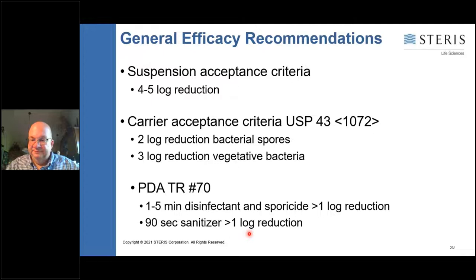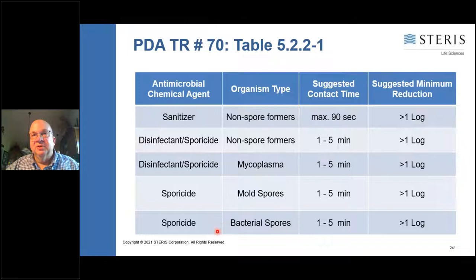This is a very nice table from PDA's Tech Report 70 that spells out what the different organisms are, what the antimicrobial agent is, so sanitizer, disinfectant, sporicide, and gives you an idea of what the contact time could be. So 90 seconds and 1 to 5 minutes, and what your level of log reduction could be, and it all states greater than 1 log. That's what you may actually see changing when it gets audited and reviewed.